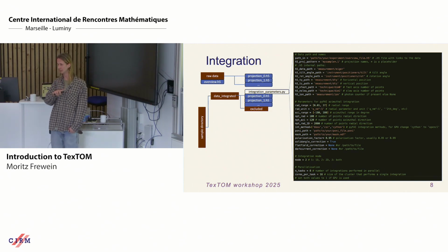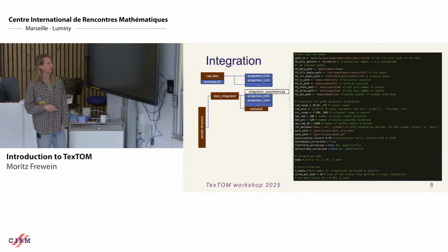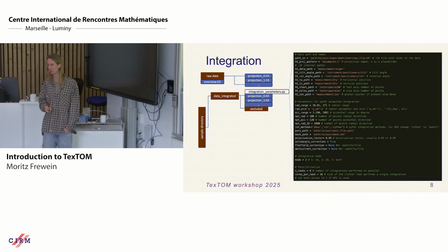We will not do this in the afternoon because this step just takes a very long time. It's probably the most expensive computation done in the whole pipeline at the moment. So if you have a data set of a few terabytes, it can easily take a few days to get all of your data regrouped in the right way.